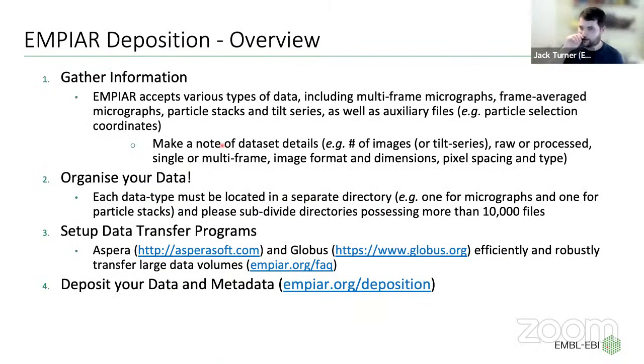Just to give an overview then of EMPIAR deposition. So start by gathering information. This is really going and looking at that policies document that I said before to make sure the data types and things like this are accepted.